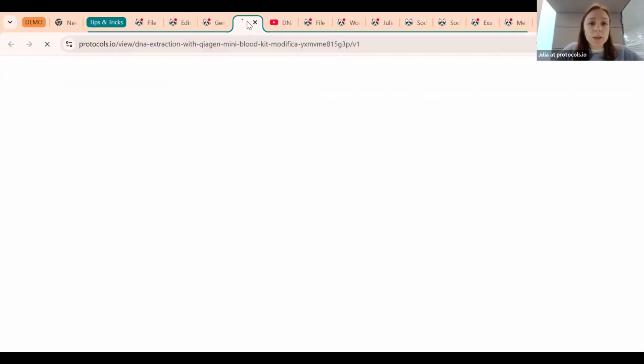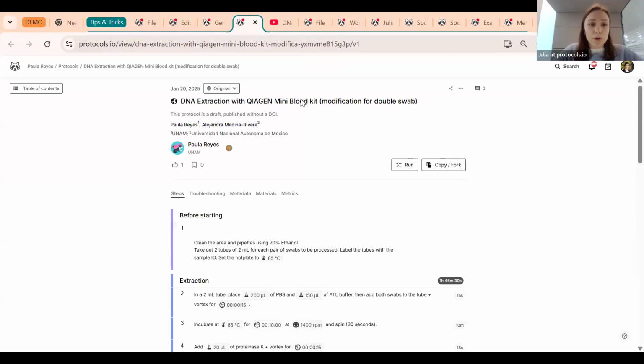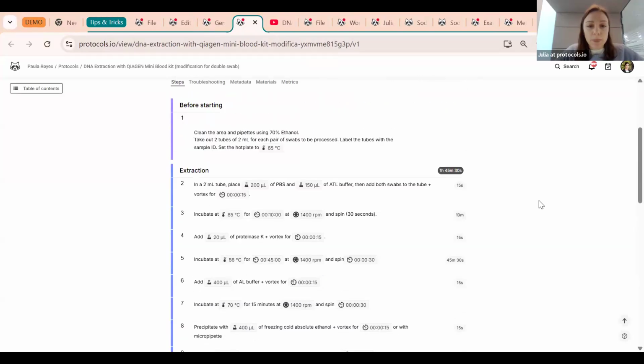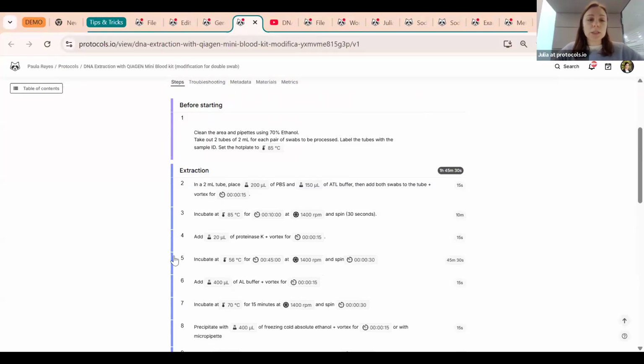And then this one is a bit more wet lab focused. And so we can see here they've put in various other components, highlighting the amounts and time as well. And when you put the information such as amounts and things like that in this structured component format, it becomes a lot more dynamic and reusable.